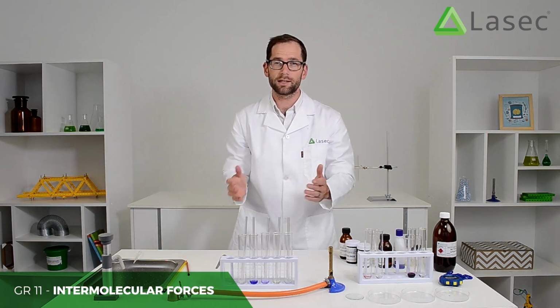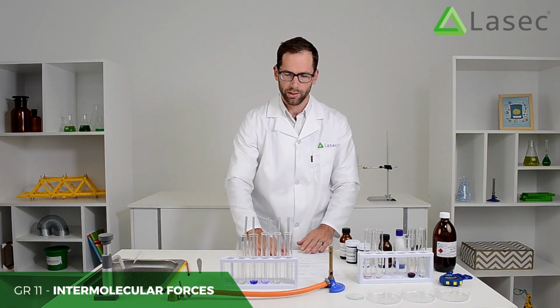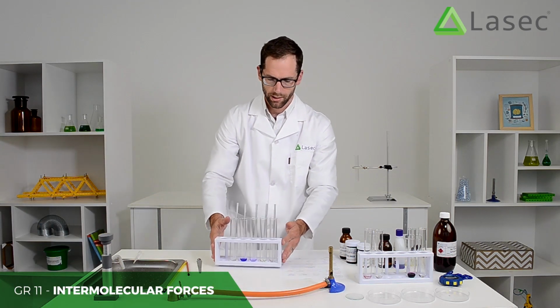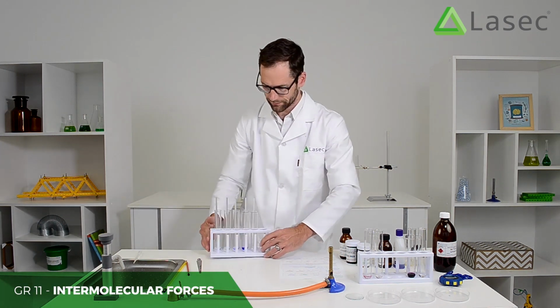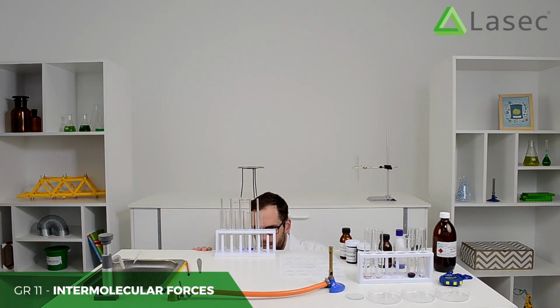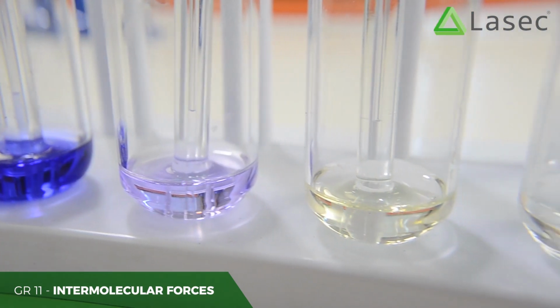Right, when you've given the tubes a little bit of time to sit in the liquid and to have a chance for the capillary action to take place, then bring that just to the edge of the table, and you want to get your eye level with the test tubes. Just going to bring this around for myself. And now I can take a look at that capillary action, and I can measure off the levels.